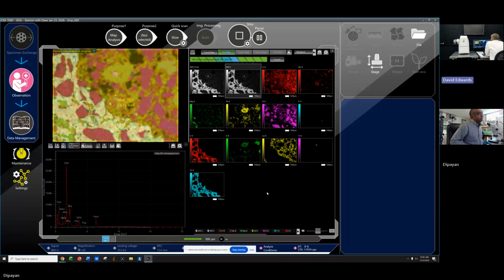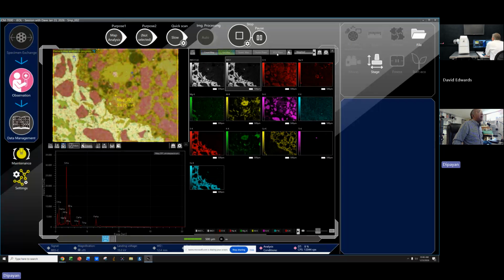So your best answer there is to not give them maps, but to give them phase pictures. Your best solution is to give them phase pictures, not map pictures. I mean, that's what comes to the next point. Should I get the net map, or the count map, or VCA? Before I go to cluster, phase will change everything. It doesn't give me the elemental map anymore. But if I want to stay in the elemental map, what would be the best option for me?